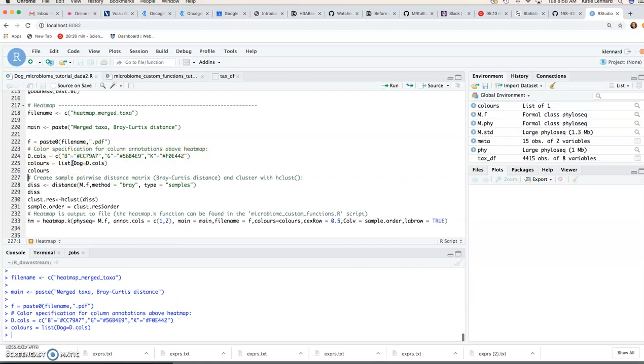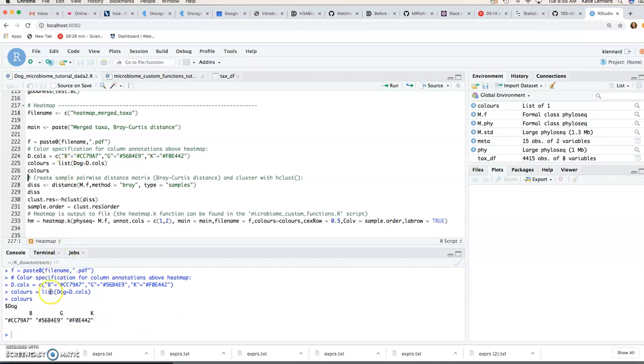So if we look and have a look at that colors you'll see we have dog B, G and K each with an associated color.